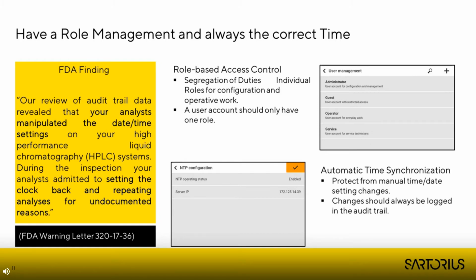With modern network devices and instruments, it should no longer be necessary to change the time manually on the system. An automatic time synchronization can ensure that the time on the instrument is always correct. This is especially important for simple embedded systems, since the time can drift away after 1 or 2 months.